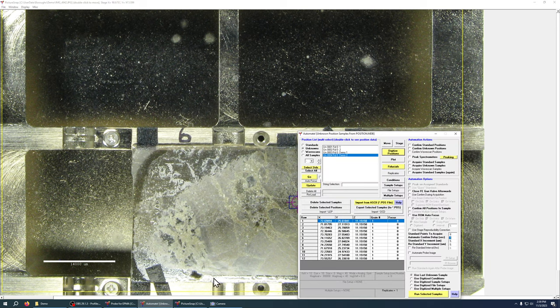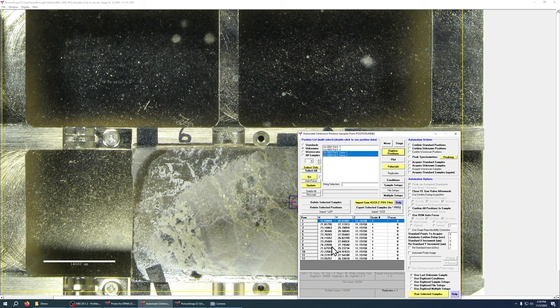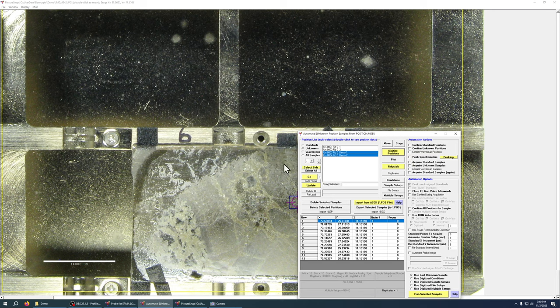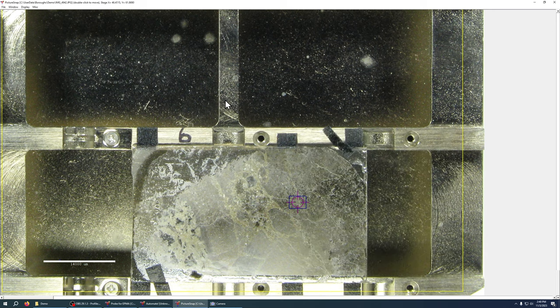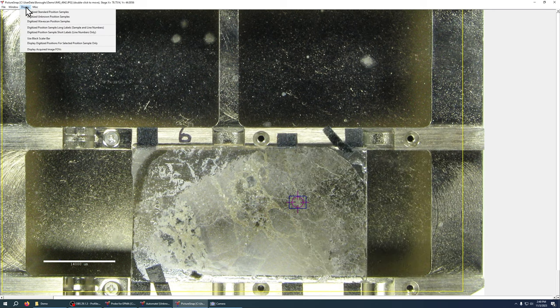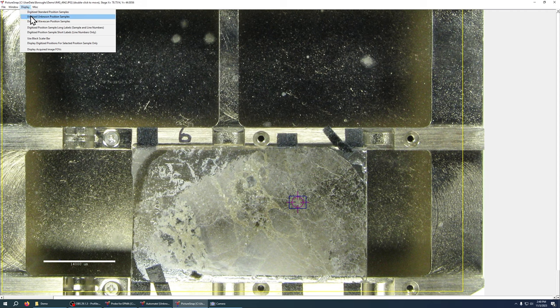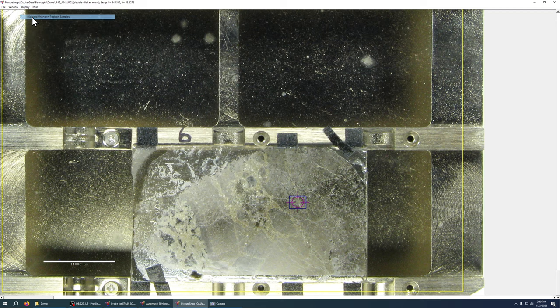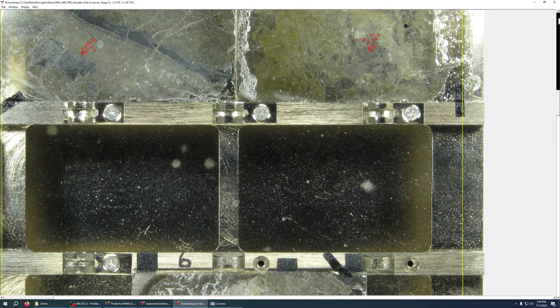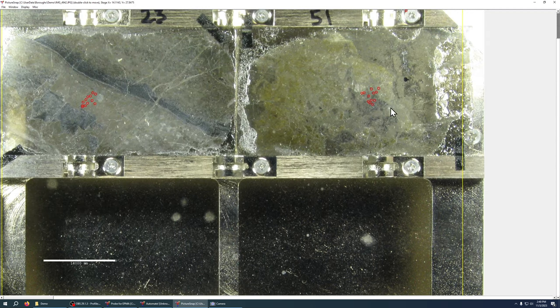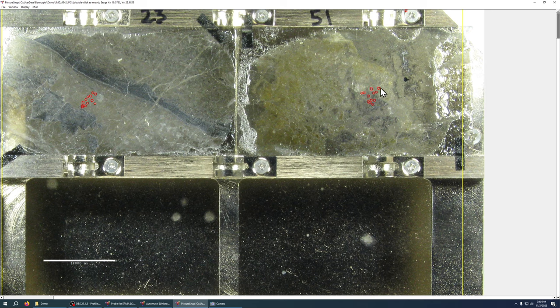But another nice feature of picture snap is that you can actually show your analysis points on there. So I've picked some points on this sample that I might want to run for analysis. So I've picked these points and now I can go to display digitized unknown positions. You can also show standard positions or wave scan positions, we'll just show the unknown positions and if we go up here now picture snap is displaying where I picked those points for analysis.